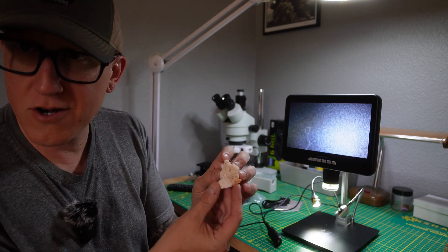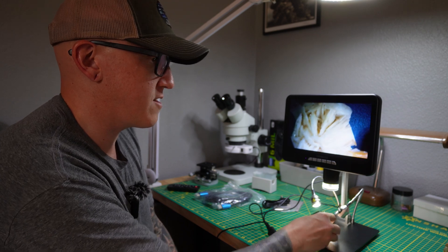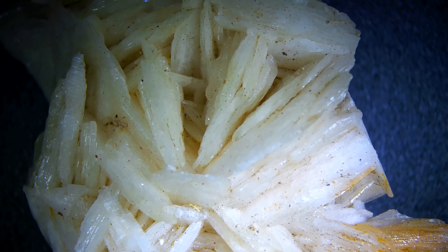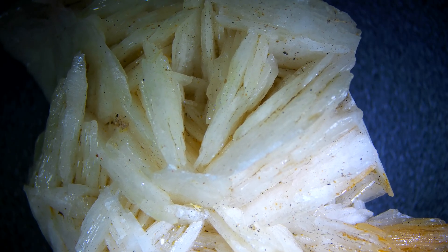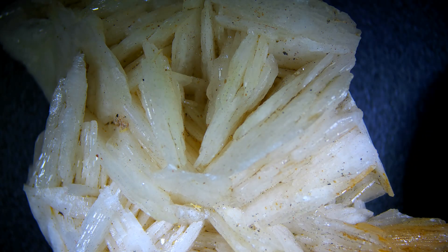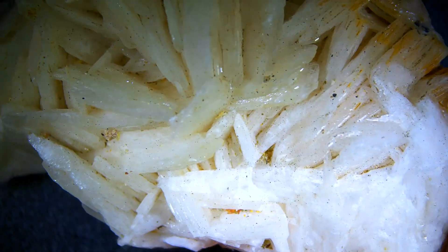We have a very dirty piece of barite here which we can look at under the microscope. We'll get this recording and look at this — and I mean, that is pretty good. Like, that is very obvious what that is.